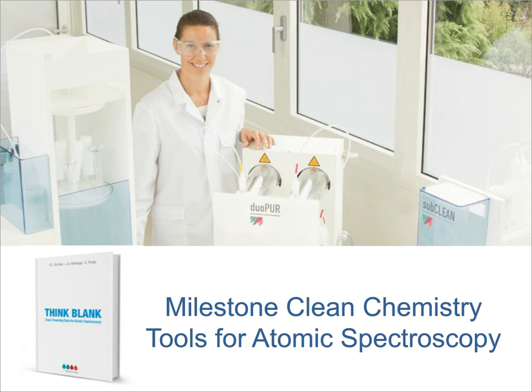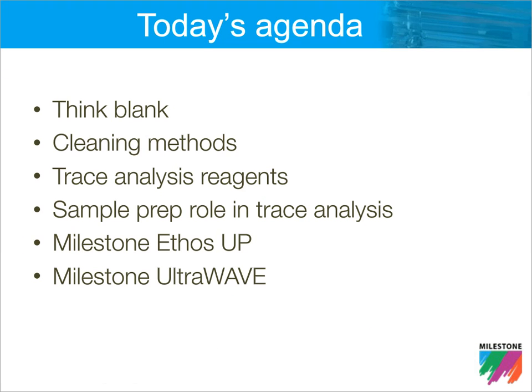So let's just take a quick look at the agenda for today. Today's speakers will cover the concept of Think Blank, cleaning methods, trace analysis reagents, the role of sample prep in trace analysis, and the Milestone Ethos UP and the Milestone UltraWAVE instruments in terms of how these fit into these concepts. Okay, Dr. Nóbrega, you have the floor.